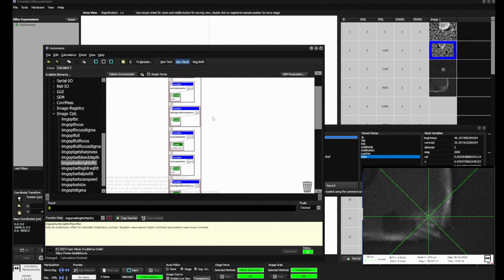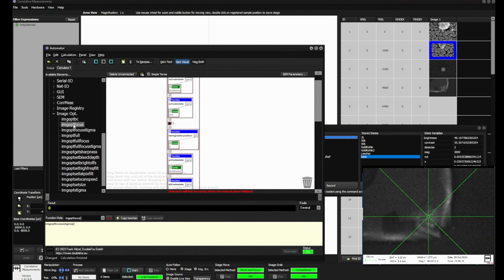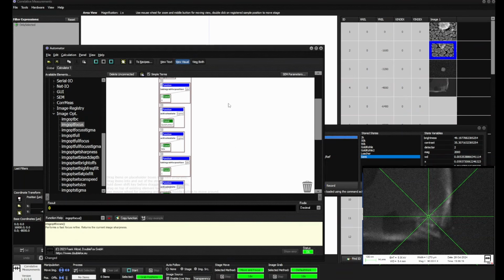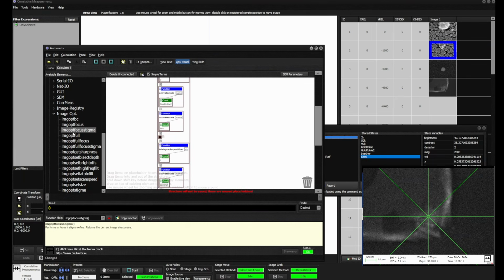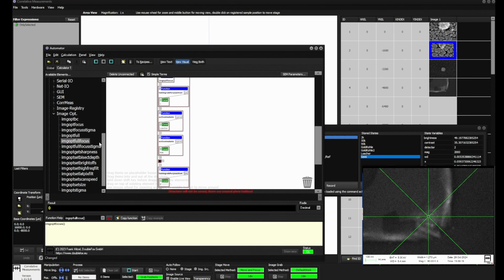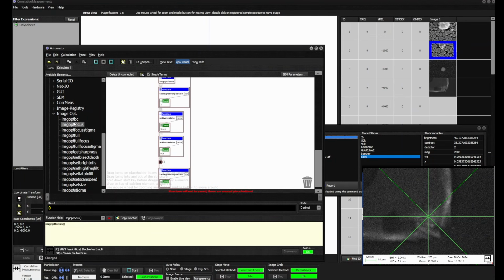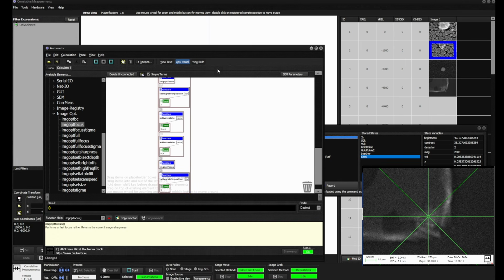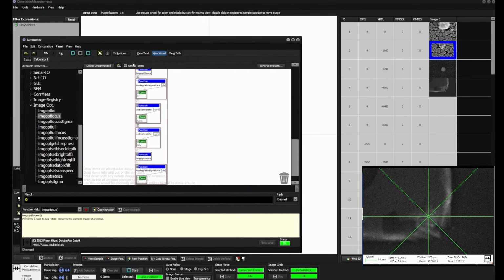So we want to insert this here after switching to the imaging condition. So image opt focus, this is a refine. Going then here after the 90K, focusing, and here we have the 90K focusing, and then here we have it as well. Good. Then let's start that, and let's see how the images compare to the other ones.